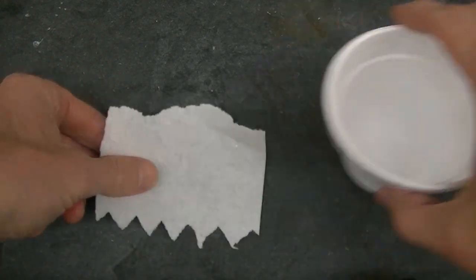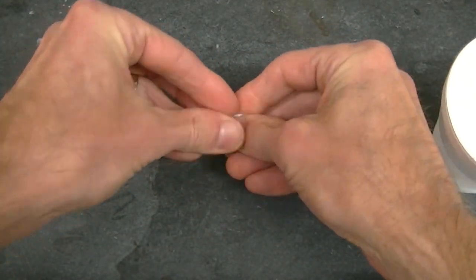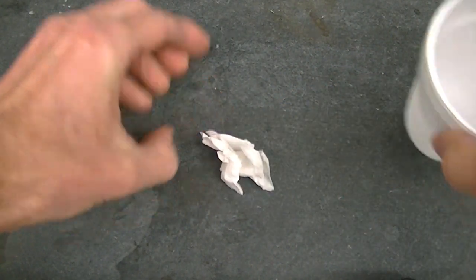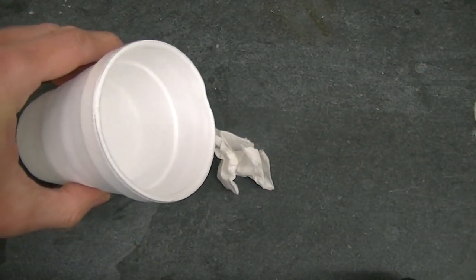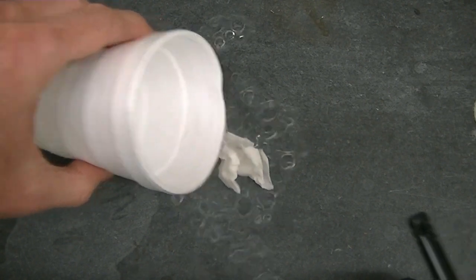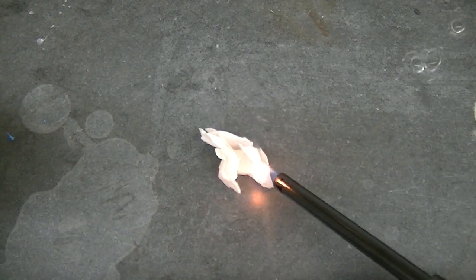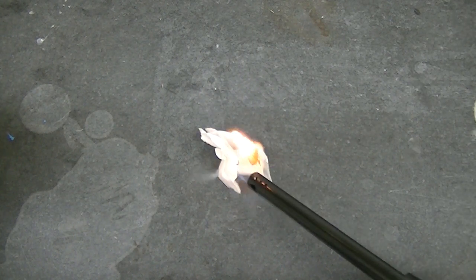I'll take this paper towel, which is a combustible material. Fold it up a little bit. Pour some liquid nitrogen on top. Then I'll take this butane lighter and light it up. Do you notice those white clouds? That's like butane condensation. Doesn't seem to want to light.